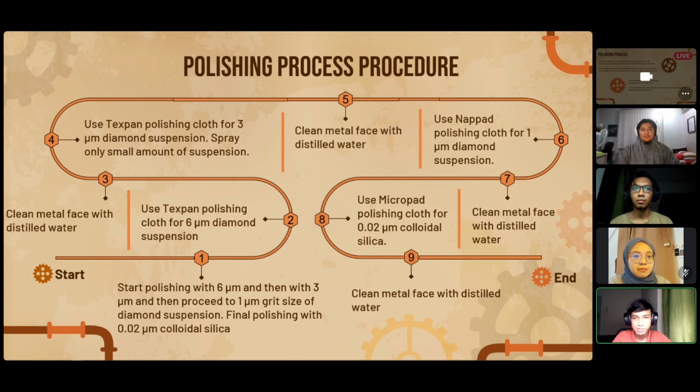8, use micropad polishing cloths for 0.02 micron colloidal silica. 9, clean the metal face with distilled water.